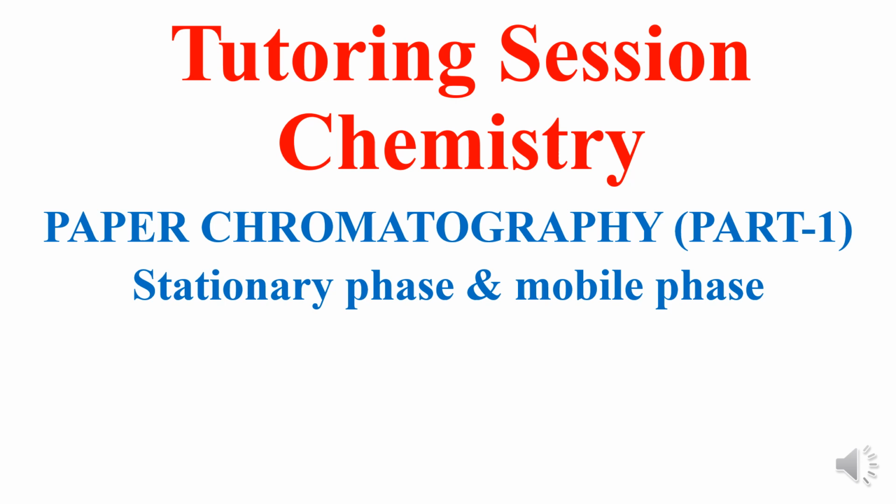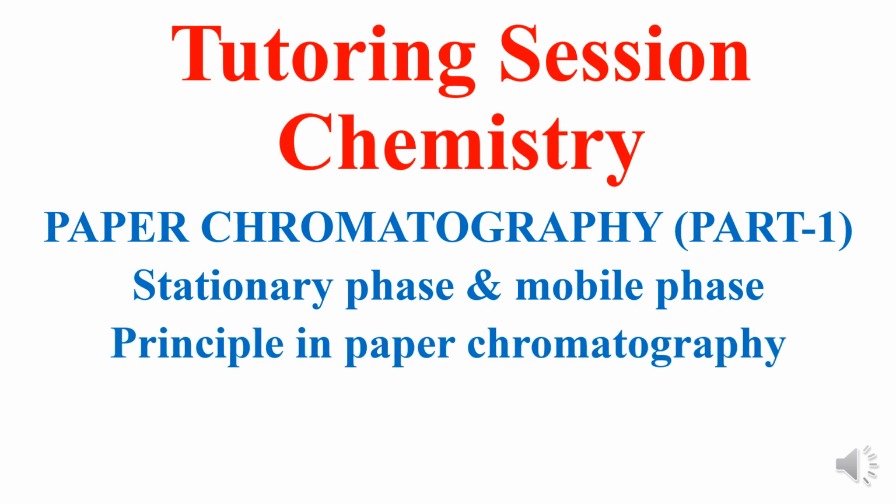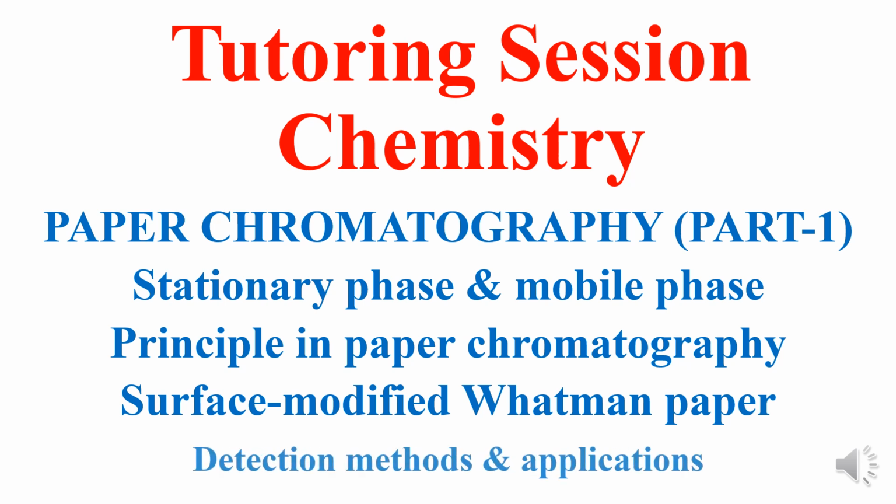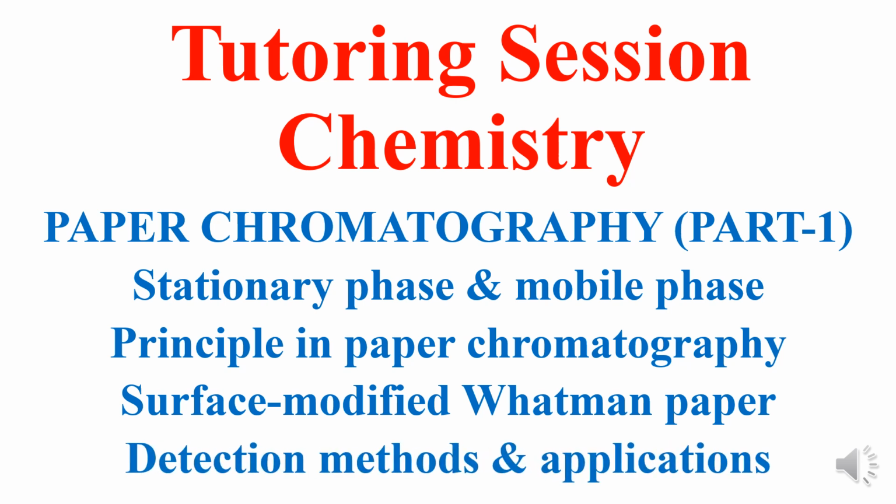I'll explain the stationary phase and mobile phase used in paper chromatography, the principle used in the paper chromatographic separation, the surface modified Whatman paper, detection methods and applications of paper chromatography.